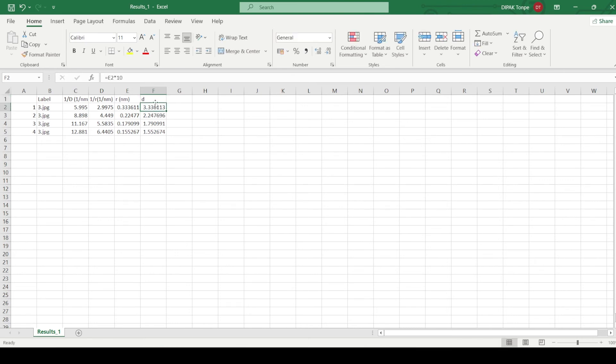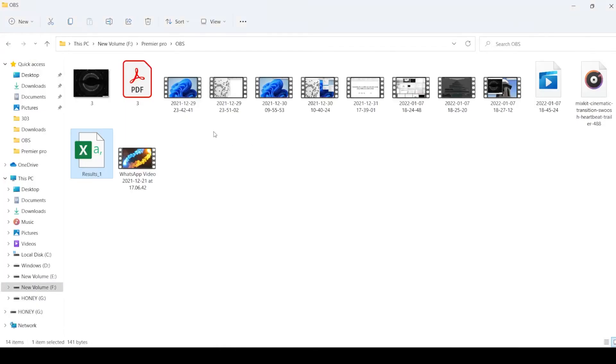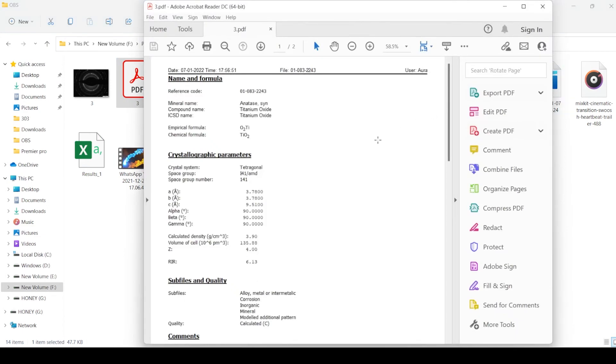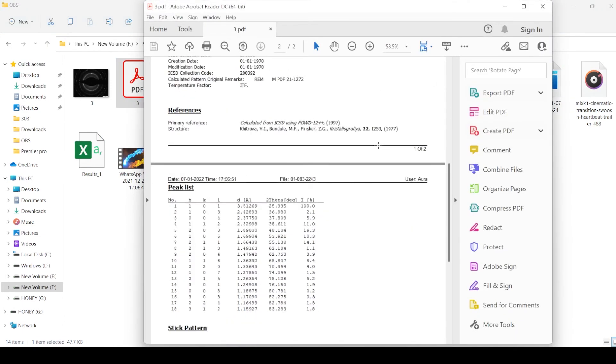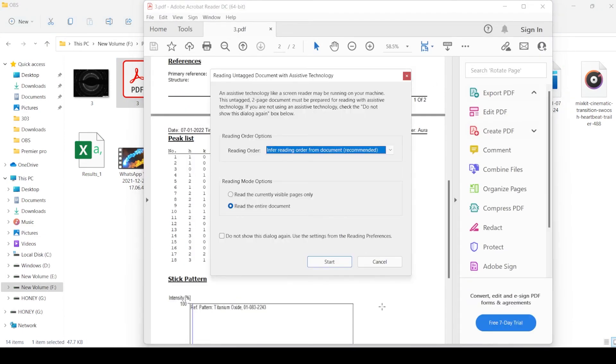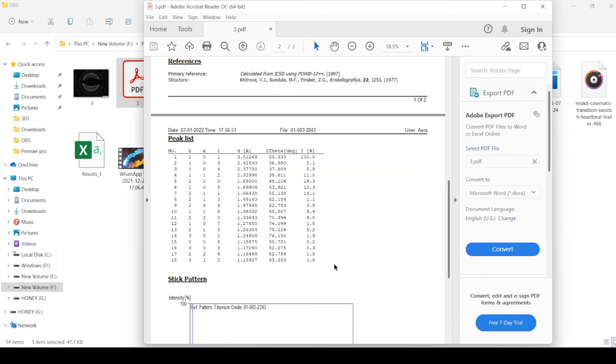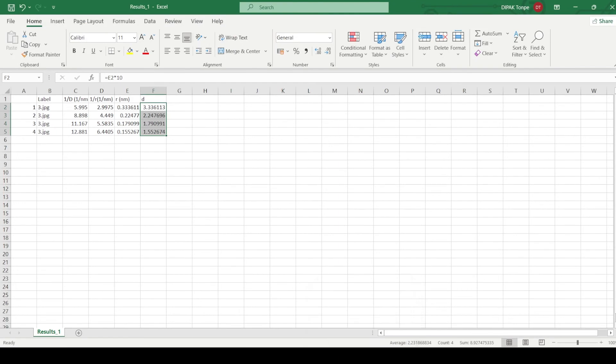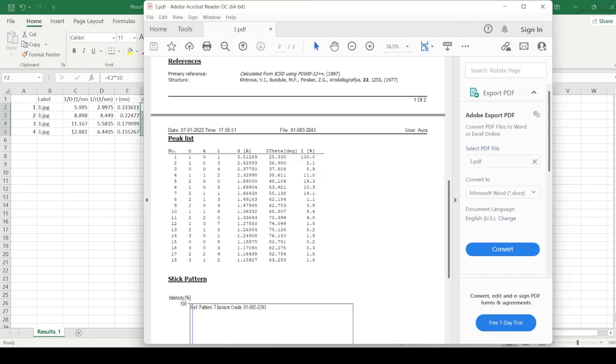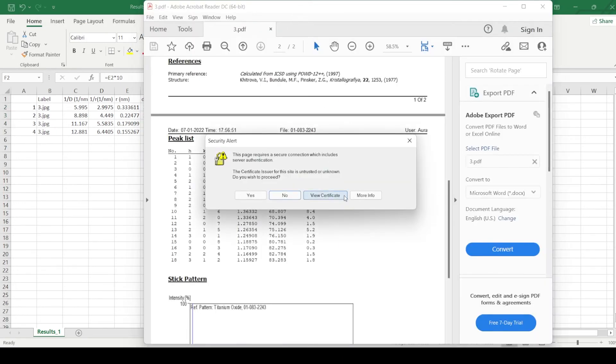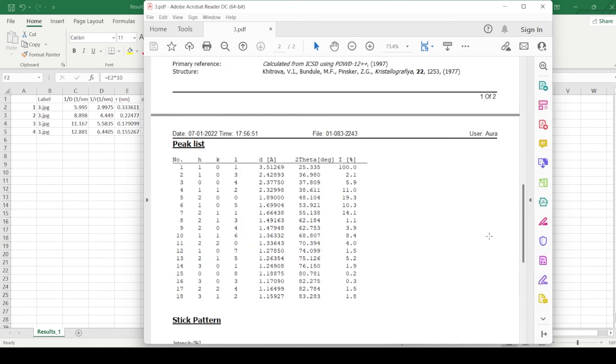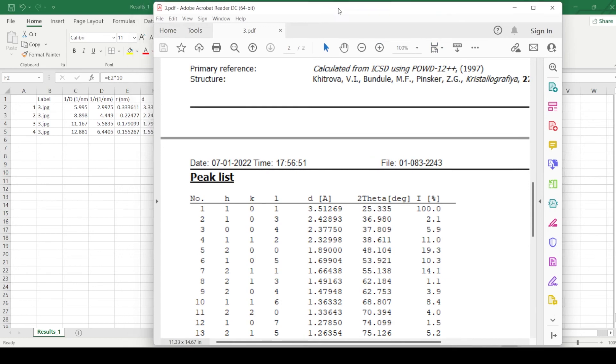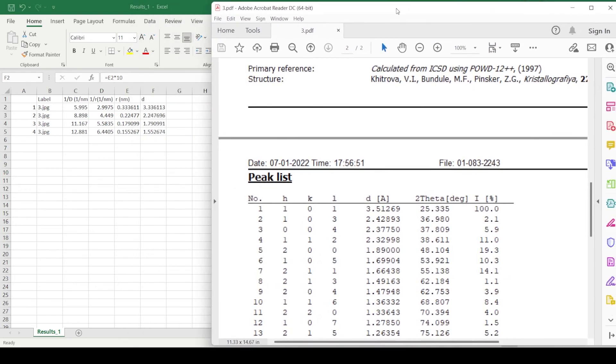Now, we will compare this d values or interplanar spacing values with the standard JCPDS card and get the hkl values or planes. Here you can see, the first is 3.3 and this is the plane which is approximately 3.6 or it is very close to 3.51. And so, the first plane is 101 plane.